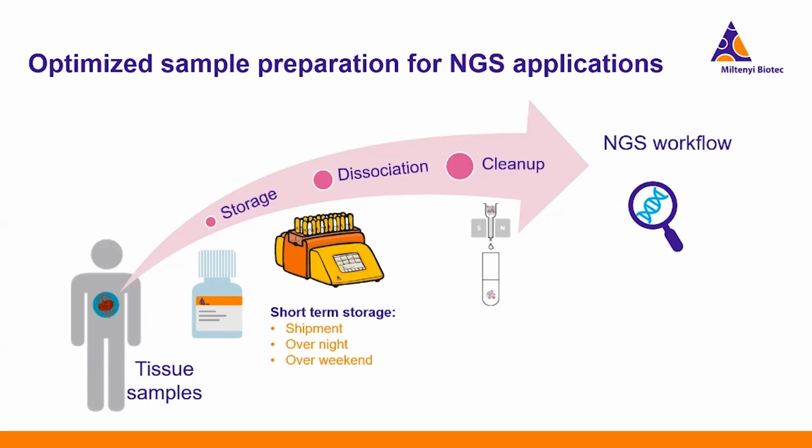And the other positive effect of storage solutions is you can store your sample overnight or even over the weekend. It also depends on when you expect the sample. For example, in some cases, the sample can be shipped to the laboratory at a very late stage, where you don't start with a dissociation. But that's not a problem if you have the right storage solution to store it overnight and then start straight away on the next day.